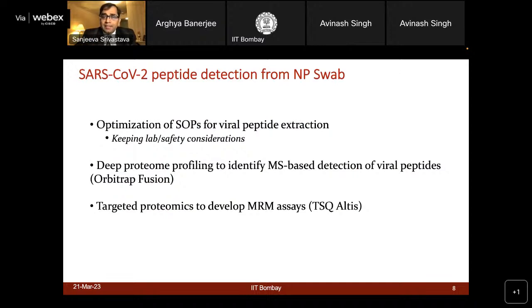Of course, many challenges were there, which I'd not like to talk about, but the idea was, can we inactivate the virus? At the same time, can we also look at the viral peptides using mass spectrometry-based methods? And once we do that, can we take our investigations forward and develop a simplified test known as multiple reaction monitoring based assays?